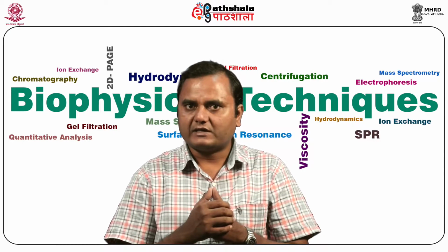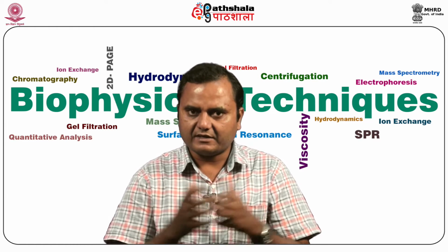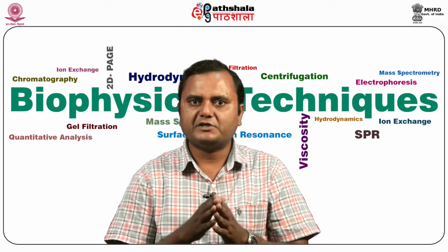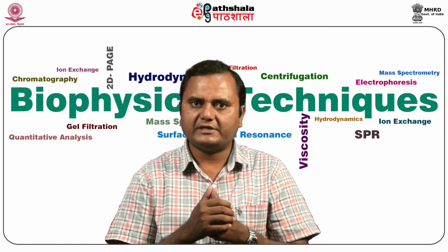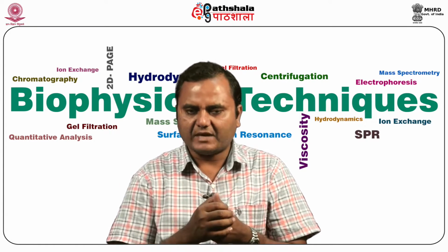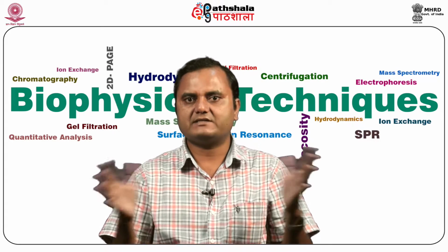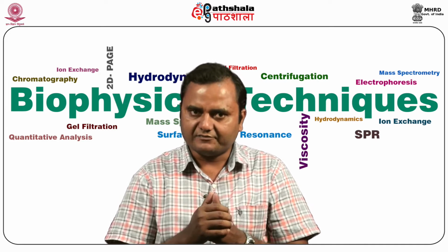Now we discuss the application of ultracentrifugation. As we already discussed the method and the principle, now we discuss the application of the ultracentrifuge. It is used for the examination of sample purity, and the quantitation of the size distribution in a polydispersed sample. For example, if you have any biological component like a protein, carbohydrate, or any cellular organelle, you want to see whether it is pure or there is some contamination. That can be performed by using ultracentrifugation.